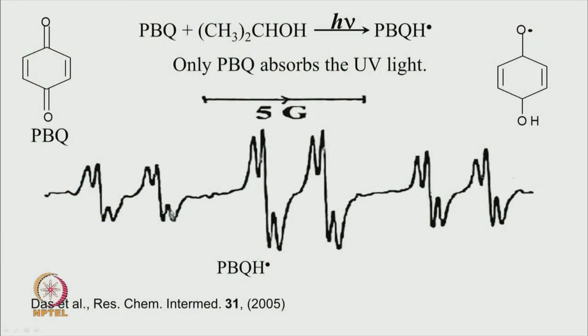So, the signal that is seen is given in this slide. This is a triplet, triplet, another triplet, triplet, this triplet, triplet. Overall you can see that this gap is the same as this gap. We can now guess, without making any careful measurement, that this gap is also the same as this gap, and each individual triplet also has similar hyperfine splitting, and overall the intensities of this and this follow 1 is to 2 is to 1.